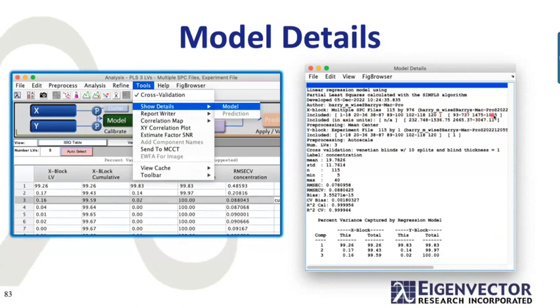This is what variables were included in here. And it also shows you the variables that are included. This is just their index number. This is actually their Raman shift right here. And so that shows you what's in it, how it was pre-processed, and then all the statistics of the model and its variance captured. So that's something that you probably want to save that file in order to document your model.